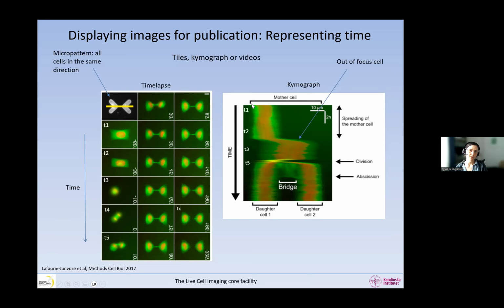And then I put all these lines across time. So this is the time dimension. I put all these lines into one image and create a kymograph. So you can see that the cell is not dividing. So we are in this situation. And then suddenly the cell comes out and lifts up. And so it sort of shows in a quite different way very, very quickly. But we still have one cell.